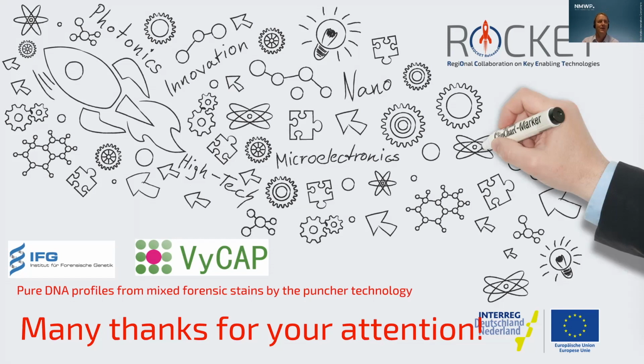That's right. Yeah, that's essential in forensics. There's always a bottleneck. We have many more samples than capacity to analyze. So it's an advantage to have an automation and to be faster, and then to solve crime. That's at the end our task.